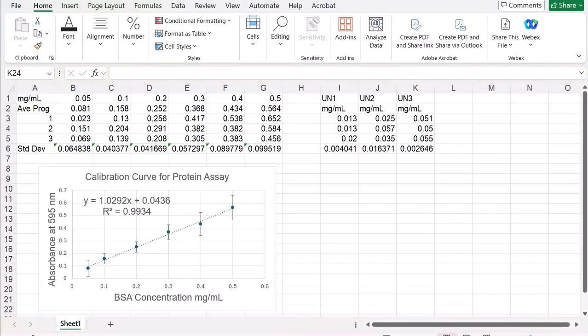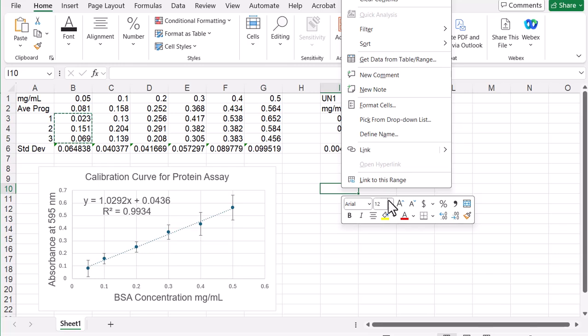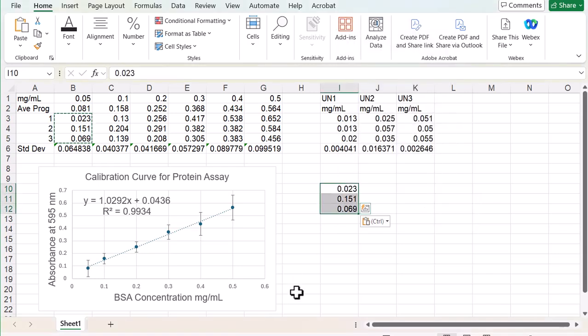All right, so here is going to be an example. Now we're in Excel, and here's the numbers that we had. And to get the standard deviation, I will, just as an example, so I copied these numbers. To calculate standard deviation, you put your numbers in the Excel spreadsheet. You then click on a blank box below the numbers you want to include in the calculation, and you drag it up. You then go up to the FX, the function key.